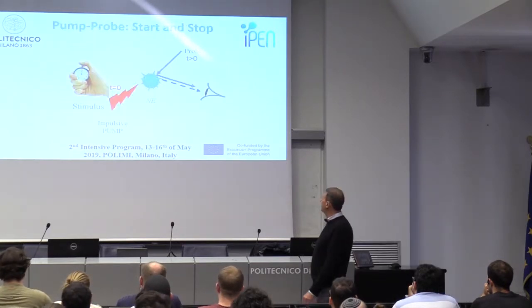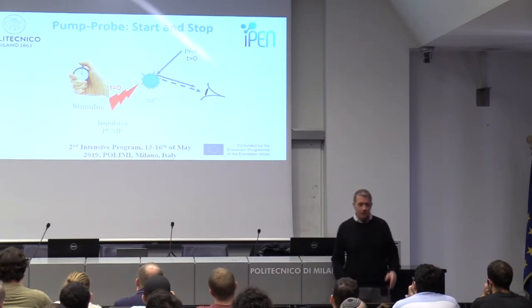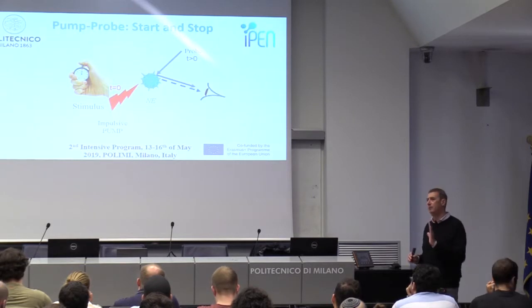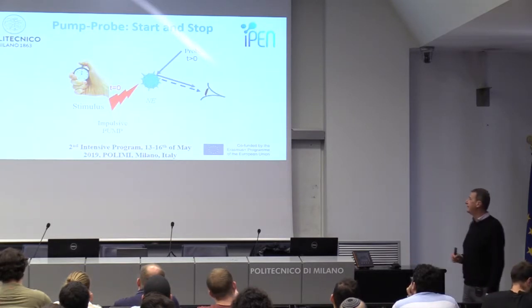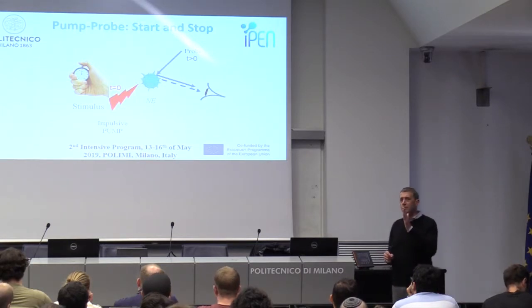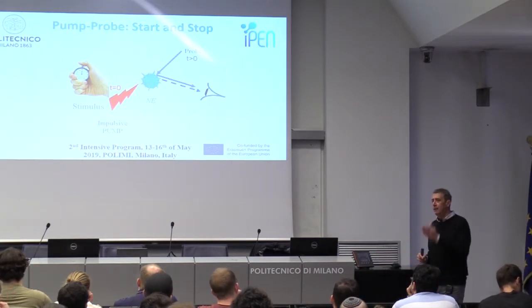So the elephant doesn't have the aerial phase. Now, the basic concept of pump probe is like the start and stop watch. Here there is another interesting thing that you see, even like the shutter with Muybridge. So you need the t equals 0. So you need a shutter.